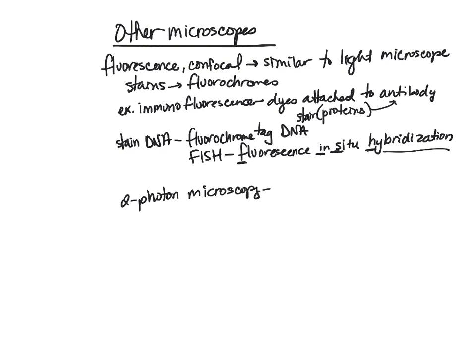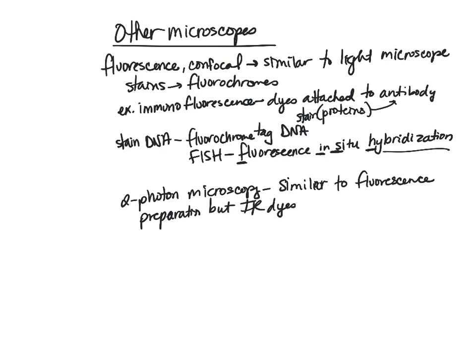In this case, it's similar to our fluorescence preparation, but we use IR dyes. So we use our infrared dyes to do our 2-photon microscopy.